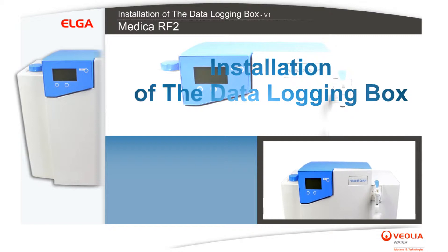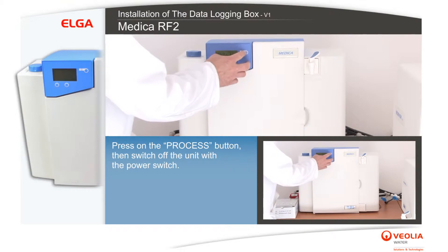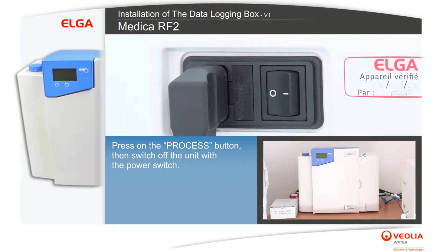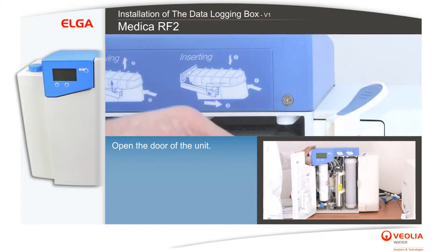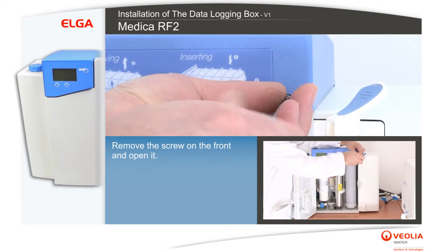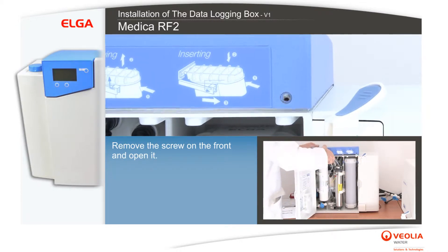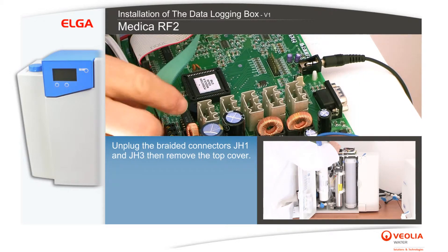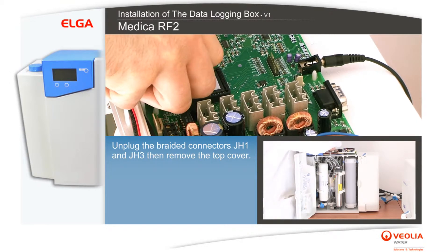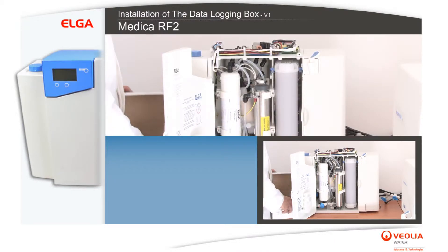Installation of the data logging box: press the process button, then switch off the unit with the power switch. Open the door of the unit, remove the screw on the front and open it. Unplug the braided connectors JH1 and JH3, then remove the top cover.